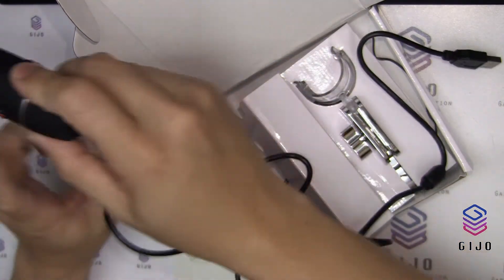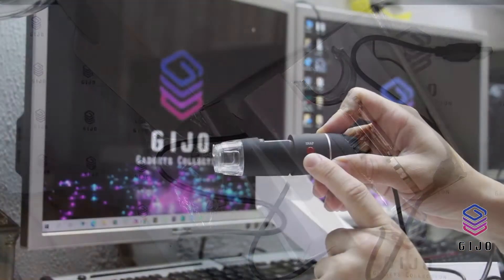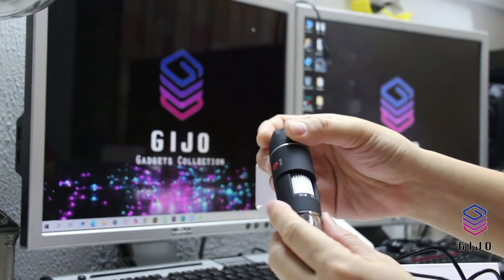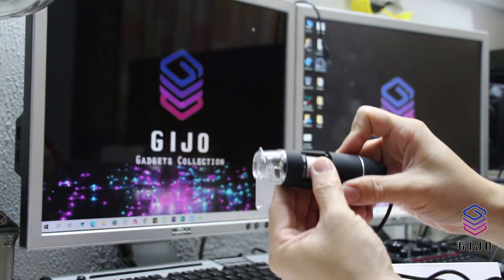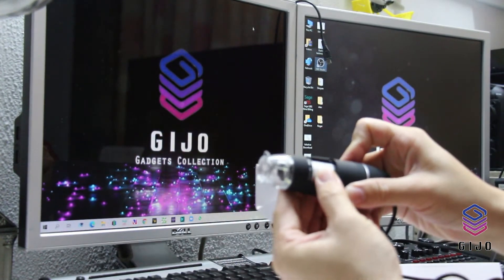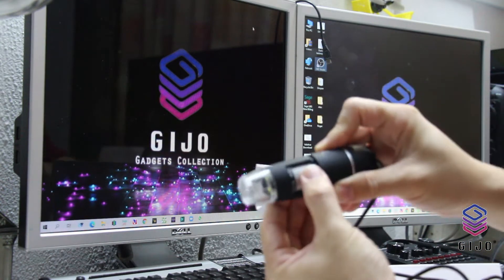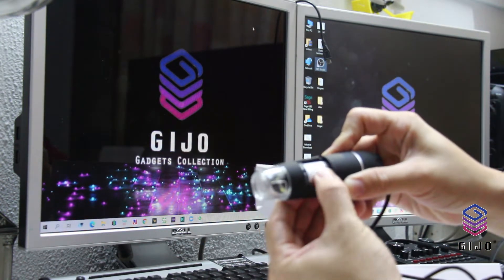So there are two buttons here. This one is snap, and this one is zoom. And this is a dial for you to set the times of the zoom, I guess.